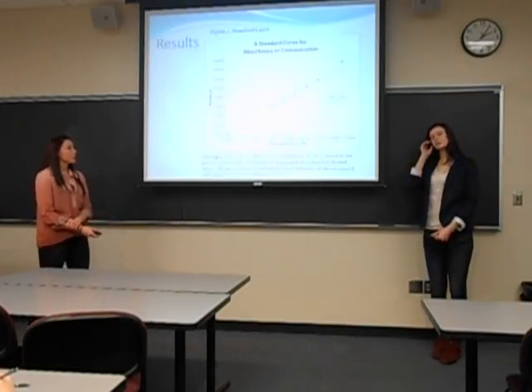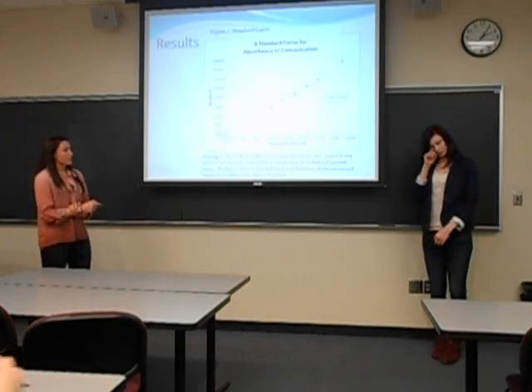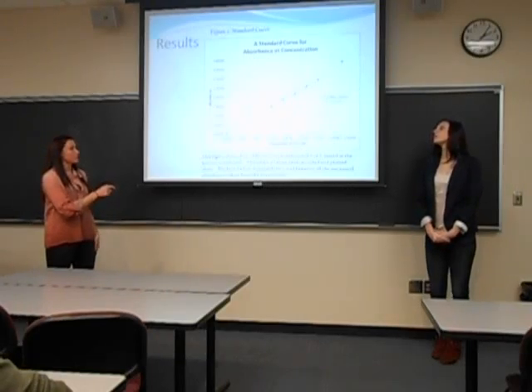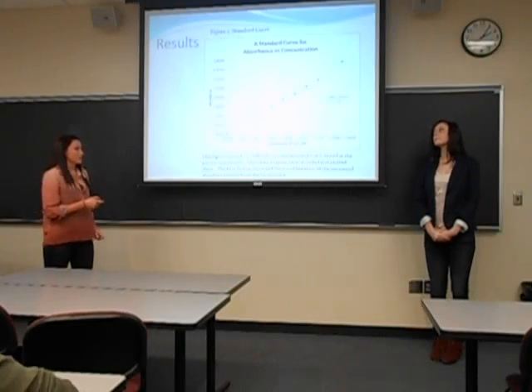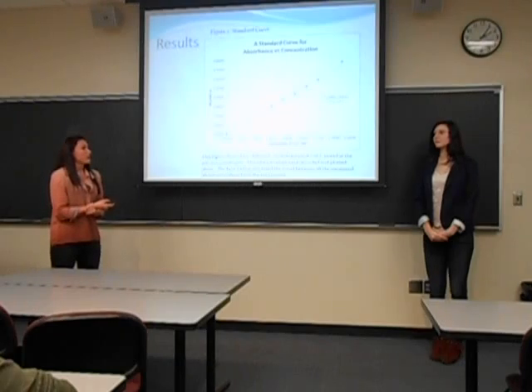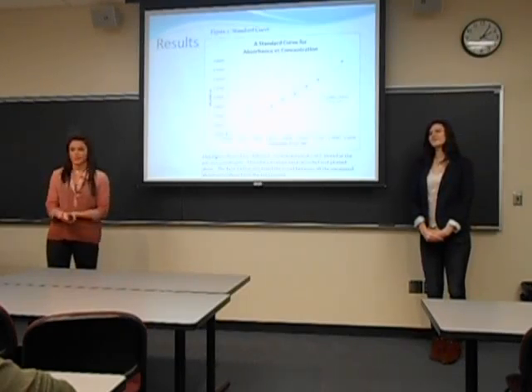Okay, here's our standard curve. As you can see, we have our best fit line and the different concentrations. Down here, the different concentrations and the absorbance that fit on the concentration. And they were plotted using 500 nanometer wavelength. And this helped us to find our unknown concentrations.